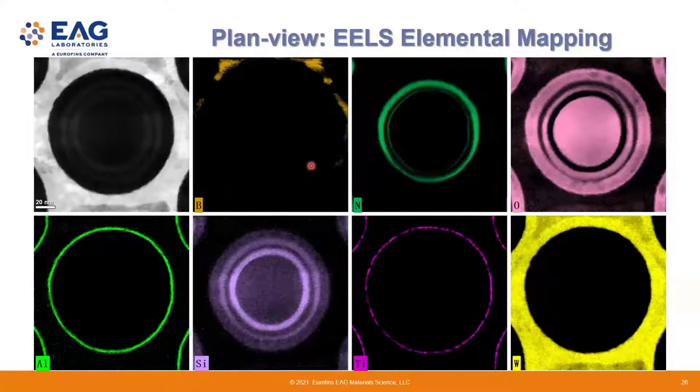I think for this audience, I don't need to emphasize too much. But before, people all thought EELS is good for light elements like boron, carbon, nitrogen, oxygen, right? But nowadays, of course, the EELS technique and EELS spectrometer have improved so much. You can basically detect even a lot of heavy elements like tungsten, gold, platinum with EELS these days, right?